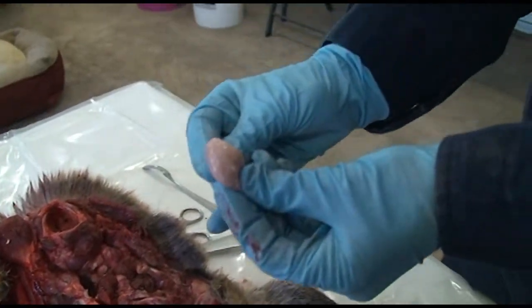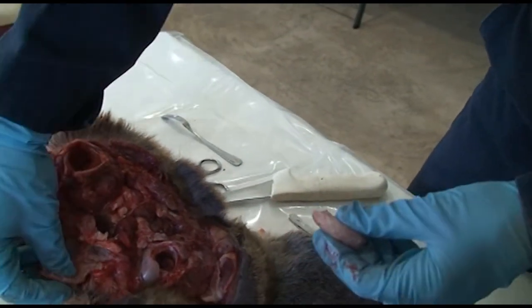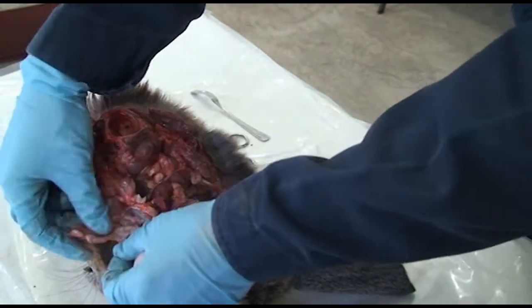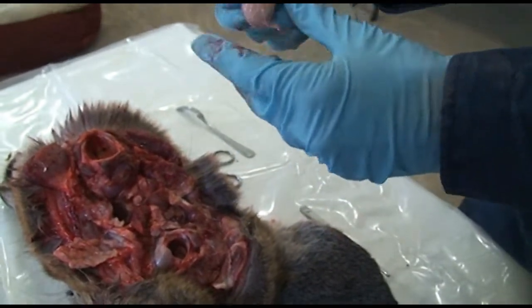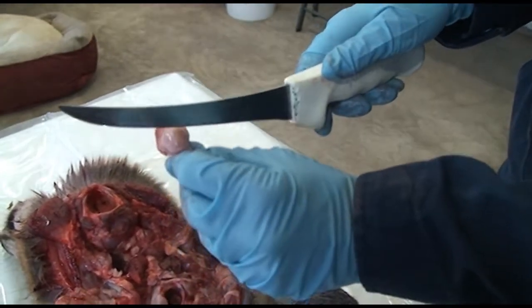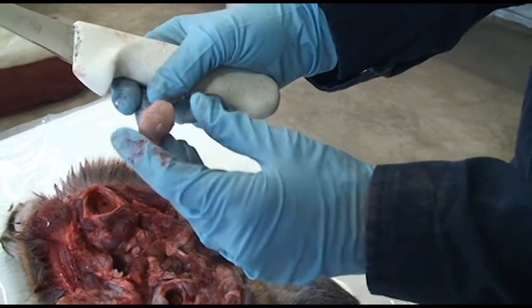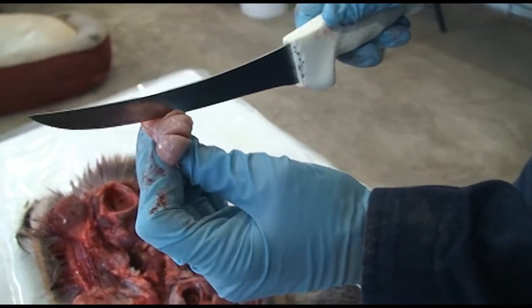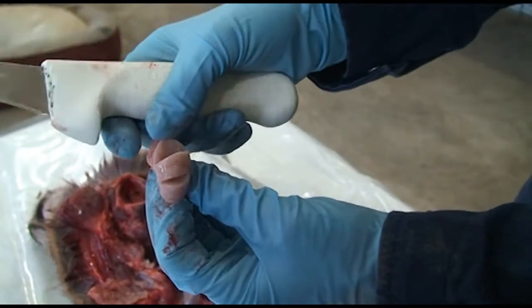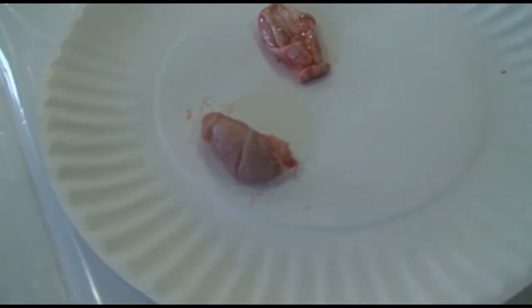And you can see it has a distinct feel to it. It's not just lobulated and hanging out there like the salivary tissue. It actually has that capsule. Now to make sure the formalin gets all the way down to the center of it and that it gets fixed well, because we're going to put these tissues in formalin, you want to what they call bread loaf it and do a couple slices about halfway down to the center of the lymph node, and that'll let the formalin get into the center of the lymph node. So that's our left one, and then we've got one more to take out on the other side.